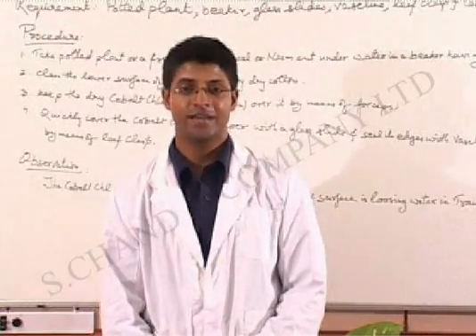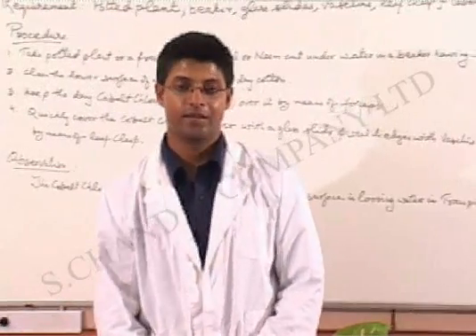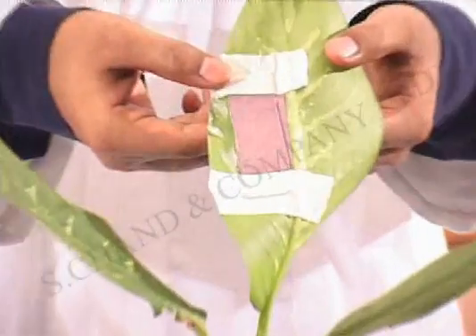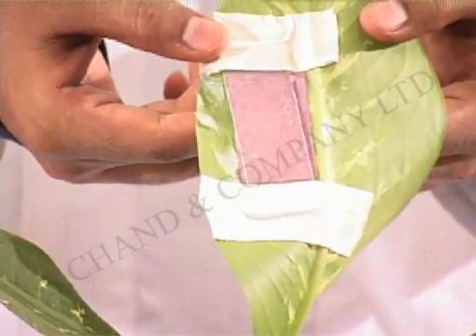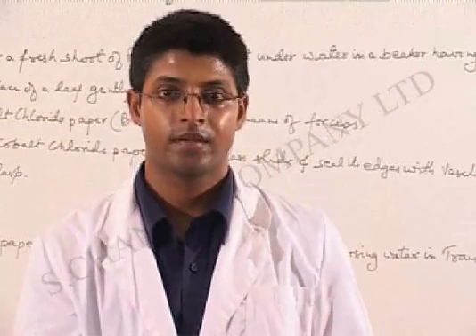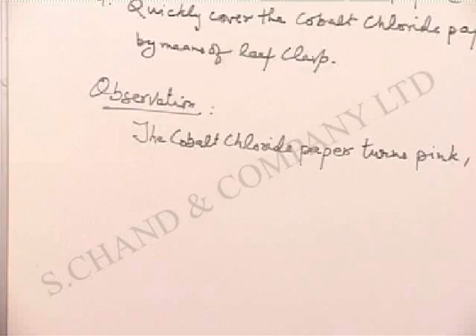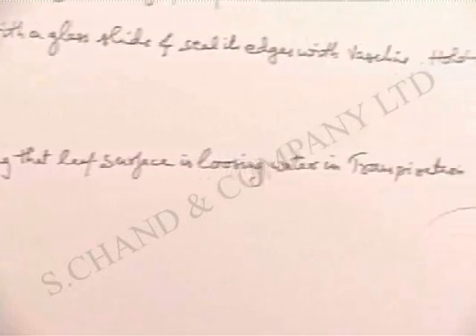We have now brought back the plant and we'll see what has happened with the cobalt chloride paper. The plant is right in front of me here, and I just turn over the leaf. You can see there is a certain change in colour. This has happened because of moisture which has escaped from the plant, and the colour has changed from blue to pink. The observation for this experiment: the cobalt chloride paper turns pink, showing that the leaf surface is losing water in transpiration.